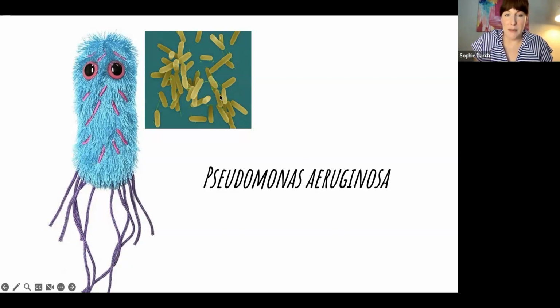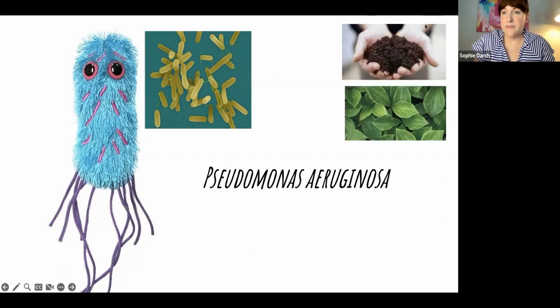This is a really lovely microscopy image. This is actually scanning electron microscopy, which allows you to get such a really wonderful up-close view of Pseudomonas. You can see the shape of the bacteria here, and these flagella that are so lovely put on this little fairy microbe, you can see here in green, that's the actual flagella of the bacteria that would allow it to swim, which is really nice and a really nice way to visualize it.